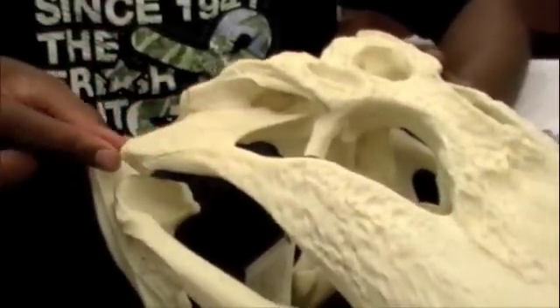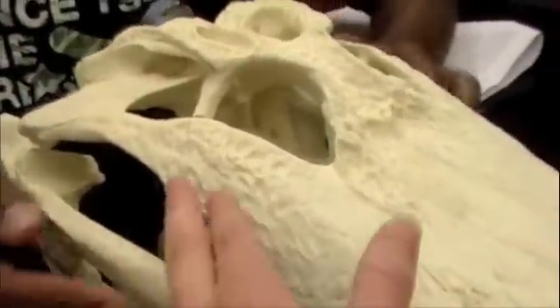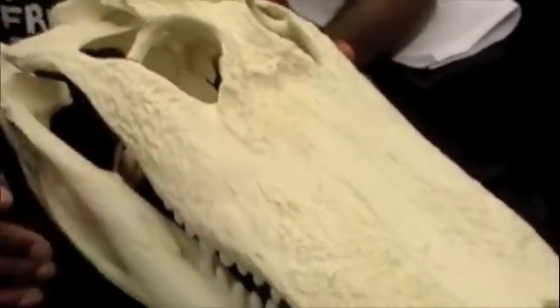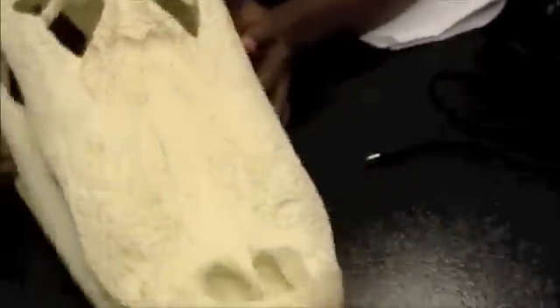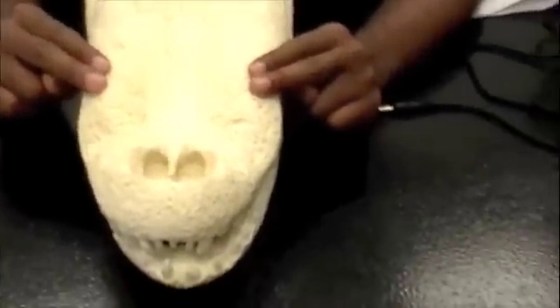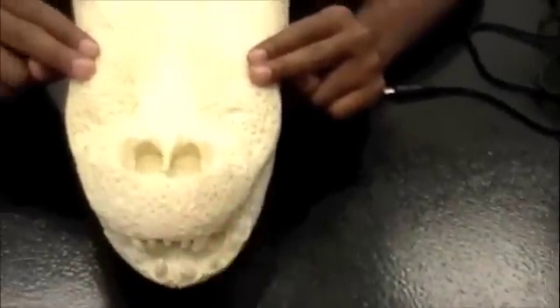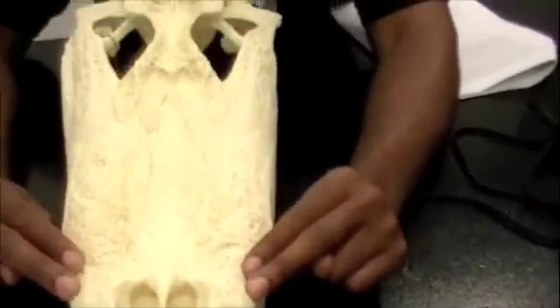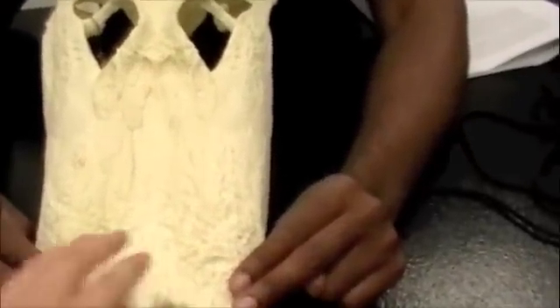Smooth area right here, and then this is the zygomatic. Cheek bone. Yeah. And then maxilla up here. Premaxilla is here. And the nasal is just the top piece.